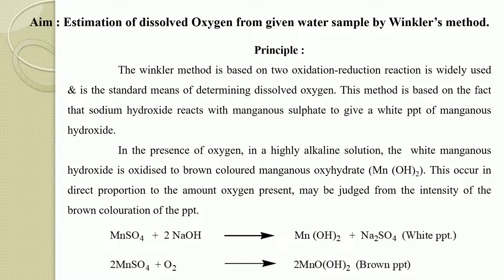That dissolved amount of oxygen present in the water sample can be measured by different methods, and one of the most standard methods used to determine or estimate the dissolved oxygen in a particular water sample is given by Winkler's method. So first of all, let's see the principle behind this experiment.